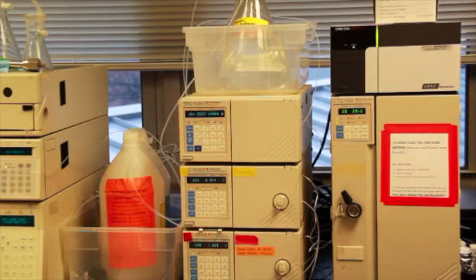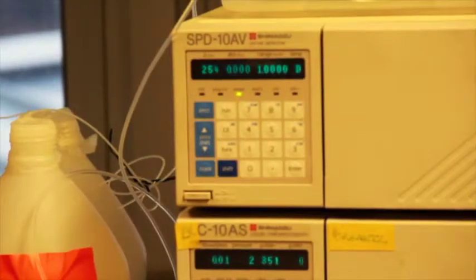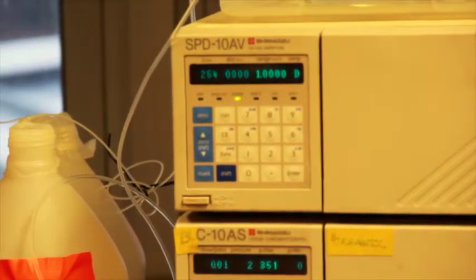It's not enough just to click on the method. You have to press download on the software. And when you are finished, your pump should have a very low pressure, somewhere down to 2 or 3 PSI.